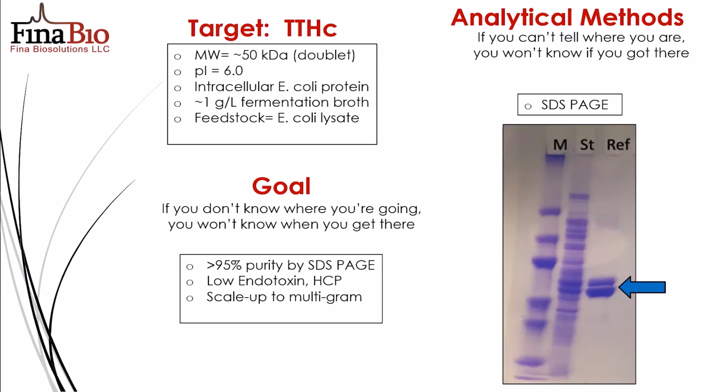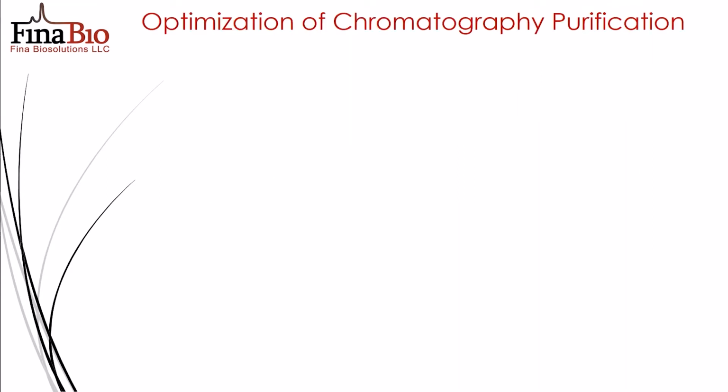Our primary analytical method is SDS-PAGE. The center lane here is our feedstock, and on the right is some purified ttHc, which we had previously prepared.